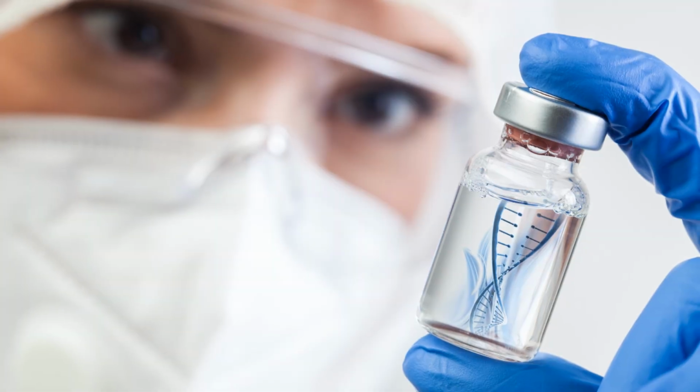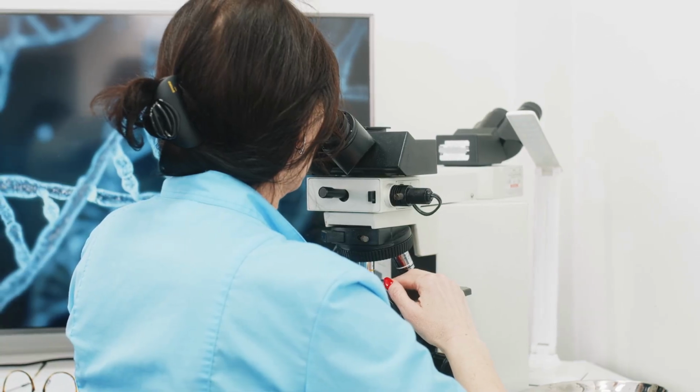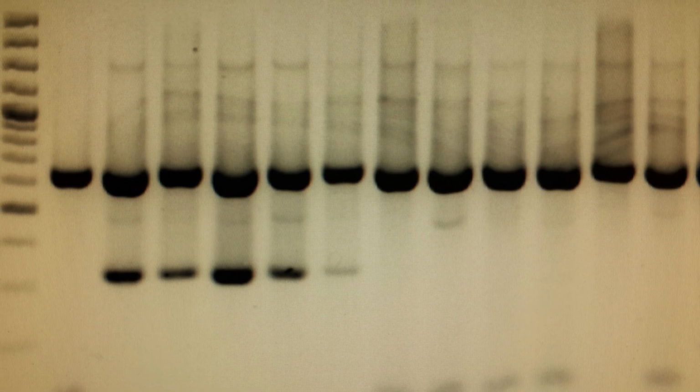Then, program your thermal cycler: denaturation, annealing, and extension. Cycling through these stages replicates the target sequence exponentially. After amplification, analyze your product using agarose gel electrophoresis or fluorescence detection to confirm successful amplification.